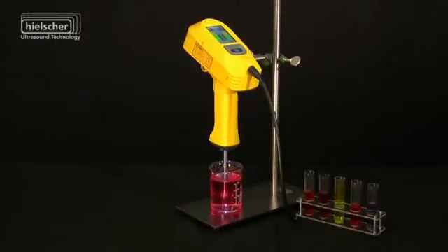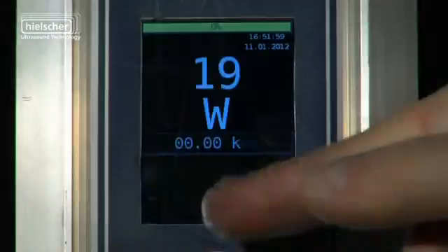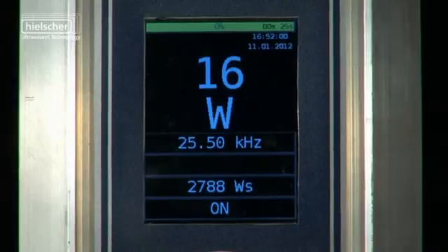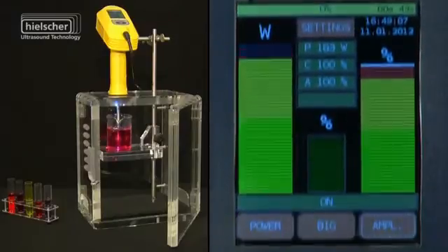Like all Hielscher ultrasonic devices, the UP200HT and the UP200ST are also equipped with an intelligent automatic frequency tuning system which optimizes the overall energy efficiency and the reliability of the ultrasound equipment.